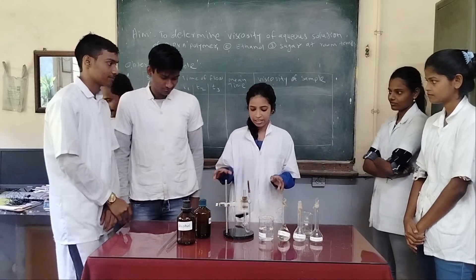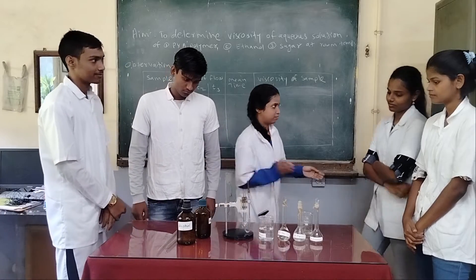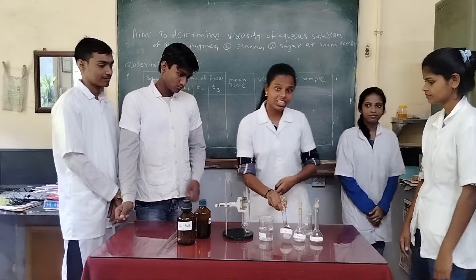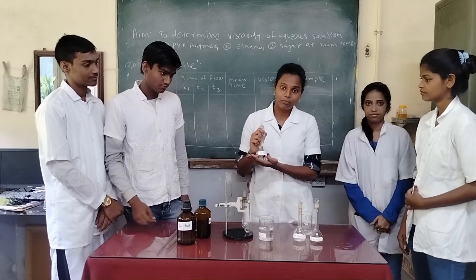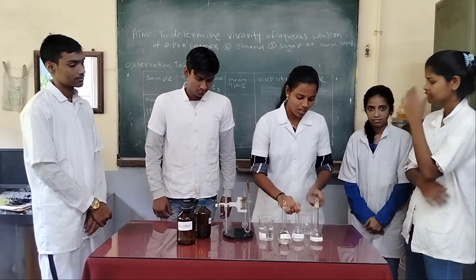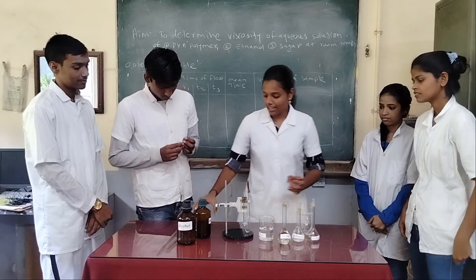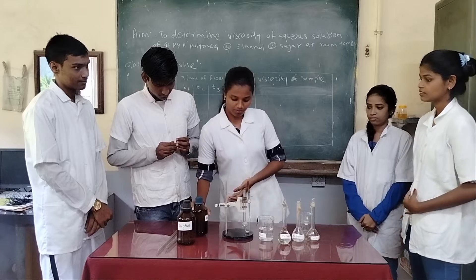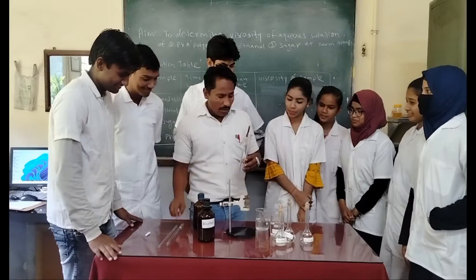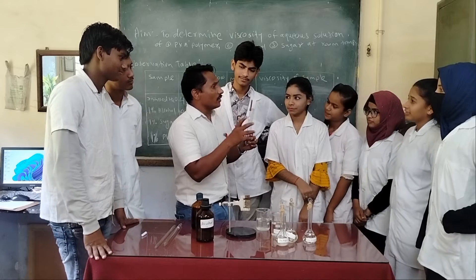We will require for this practical an Ostwald viscometer. The chemicals we require are 1% PVA, 1% sugar and 1% ethanol, distilled water, and acetone for cleaning purposes. This is the Ostwald viscometer.